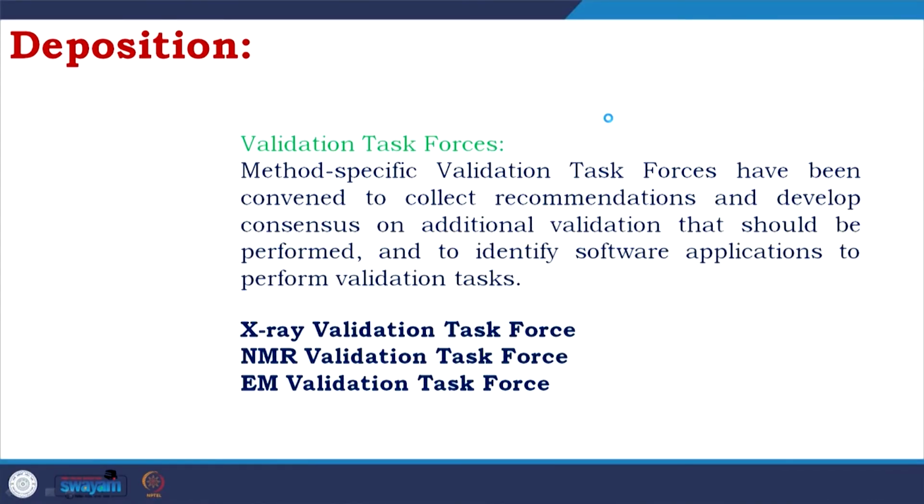So, there are validation task forces: the X-ray validation task force, the NMR validation task force, and the electron microscope validation task force. A crystallographer like me is there in the X-ray validation task force, and an NMR specialist is there in the NMR validation task force. They look at other factors which the automation programs are not able to detect, and they will send you back again to improve those factors.